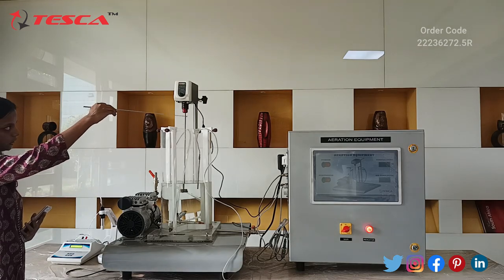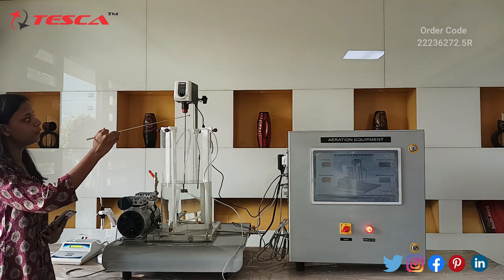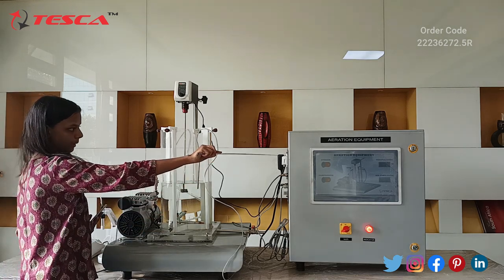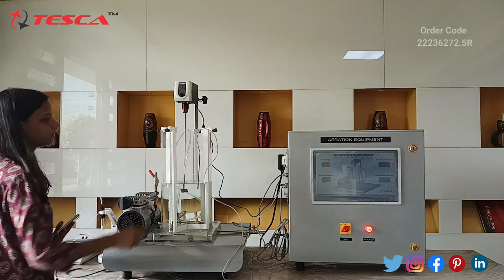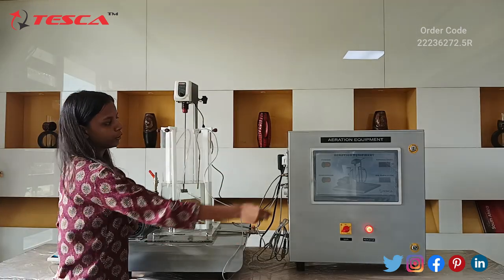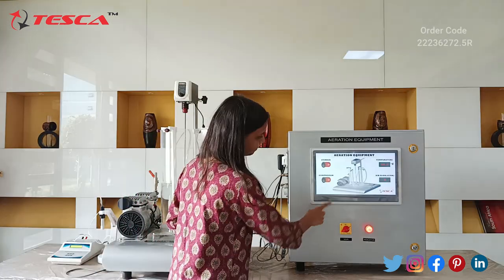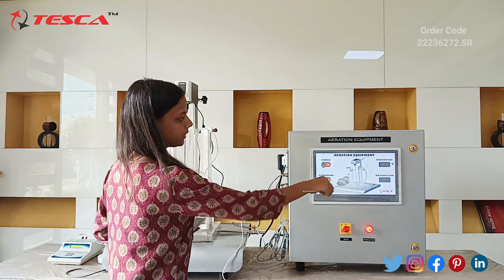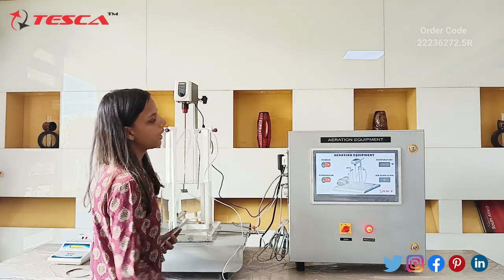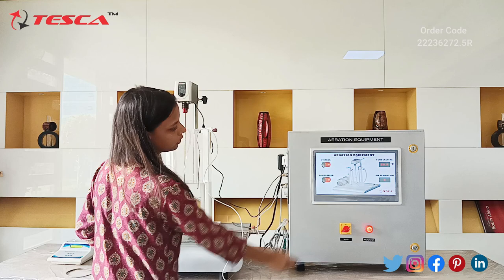This tank also has a stirrer, and a control unit with which we can measure the RPM and timer of the stirrer. We also have these connectors — this one is for the air pump, this is for the DO meter, this is for the control unit of the stirrer motor, this is for air flow, and this is for temperature. This is our control unit of the aeration equipment — you can see the main switch, the LED indicator, and the screen.